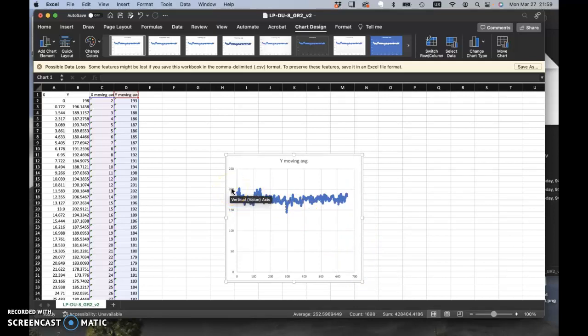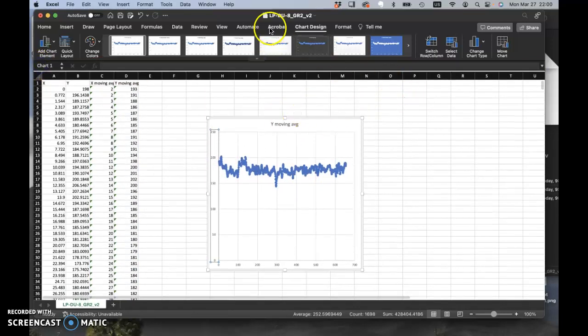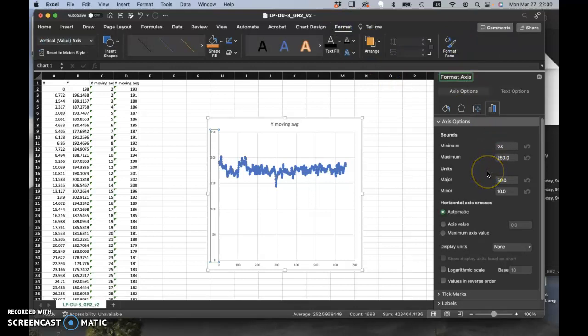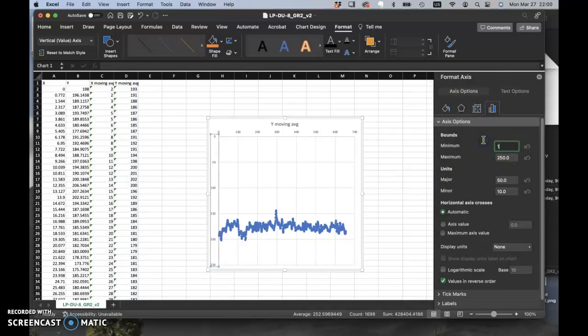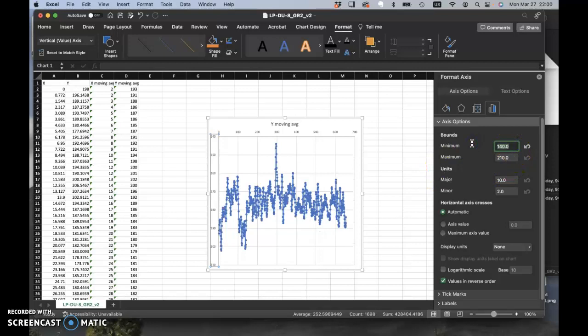And note that if you want to think about grayscale in terms of magnesium number, you need to invert the scale, because grayscale is inversely proportional to magnesium number. So I would recommend doing that in the format pane. You can show values in reverse order, okay? And this will be reflecting the actual variations in magnesium numbers. So you can adjust the scale to see better what's going on. So from our values of 100, or maybe 140. Okay. Now I start seeing some patterns.